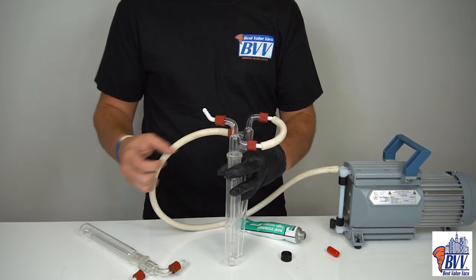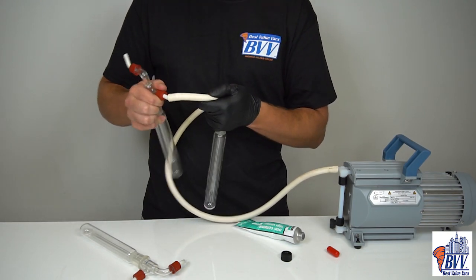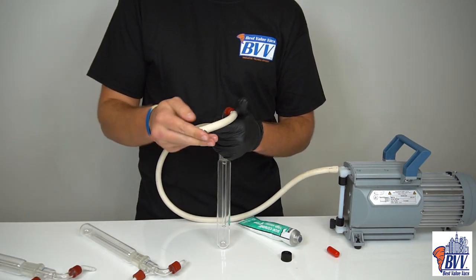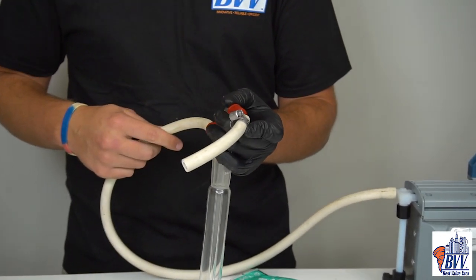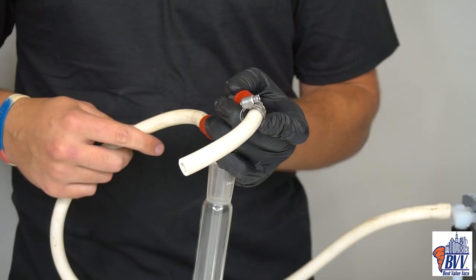Just put it around the barbed connection after the gum rubber is already on. So if I wanted to put a hose clamp on here, I'd put it like that and tighten it down. This will just make sure that your gum rubber doesn't fall off the barb while in use.